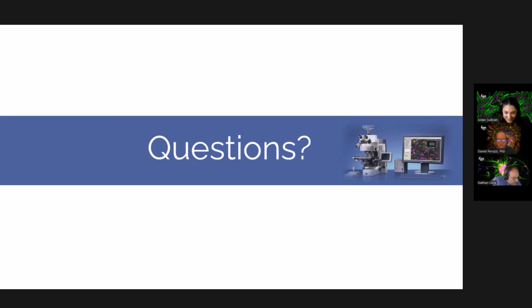Okay, so next question we have is, how would you choose the size of the counting frame and grid spacing for the dots and sampling interval with the area fraction fractionator probe? So there's a different probe, but yeah, another question about setting that up. You remember at the beginning of the talk, we talked about how you can estimate number, but also length or surface or volume. So this comes under volume, and area fraction fractionator probe is a probe to estimate the percent by volume of one type of tissue, one phase of tissue.